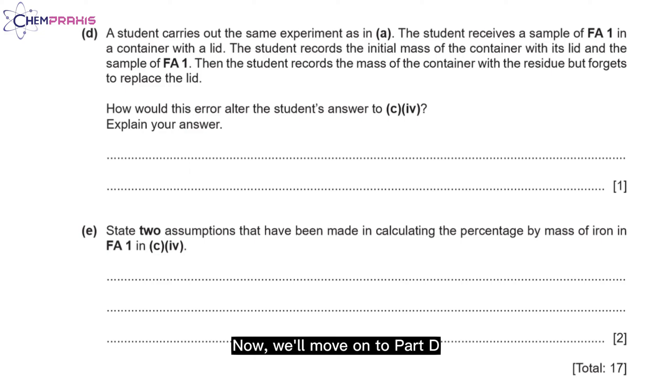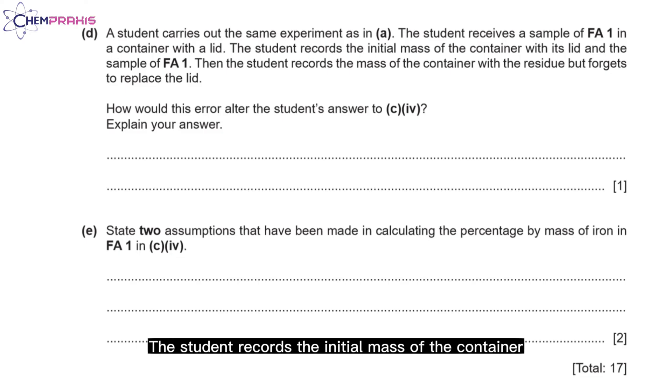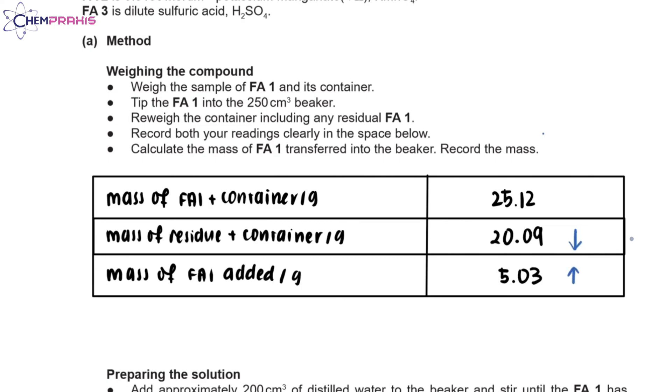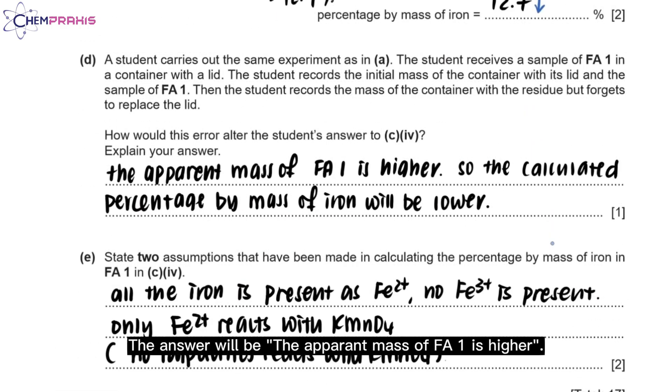Now we'll move on to part D. A student carried out the same experiment as in part A. The student received FA1 in a container with a lid, recorded the initial mass with the lid and sample, then recorded the mass of the container with the residue but forgot to replace the lid. How would this error alter the student's answer in part C question 4? If the student forgot to replace the lid, the mass of the residue with the container would appear lower, so the mass of FA1 added would appear higher. Therefore, the calculated percentage by mass of iron would be lower.